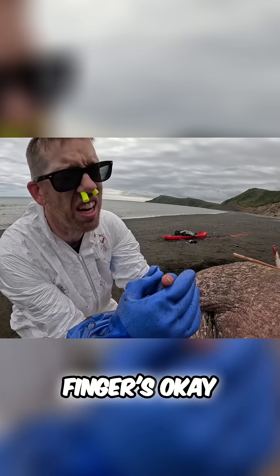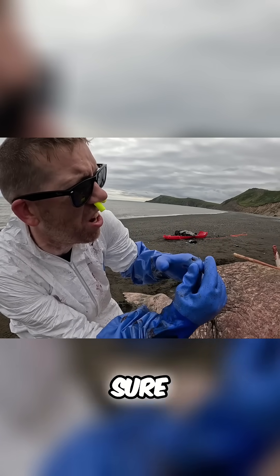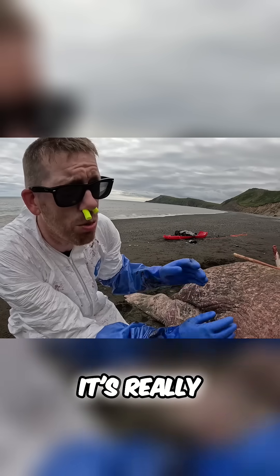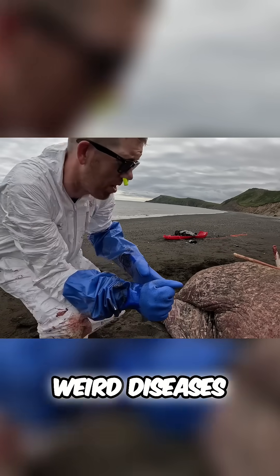I nicked my glove — gotta make sure my finger's okay. A tiny tiny cut, but I'm not sure if it even went all the way through the skin. I'm gonna go put a band-aid on that real quick and wash it off. It's really common for walruses to have trichinosis and I don't want to catch any weird diseases.